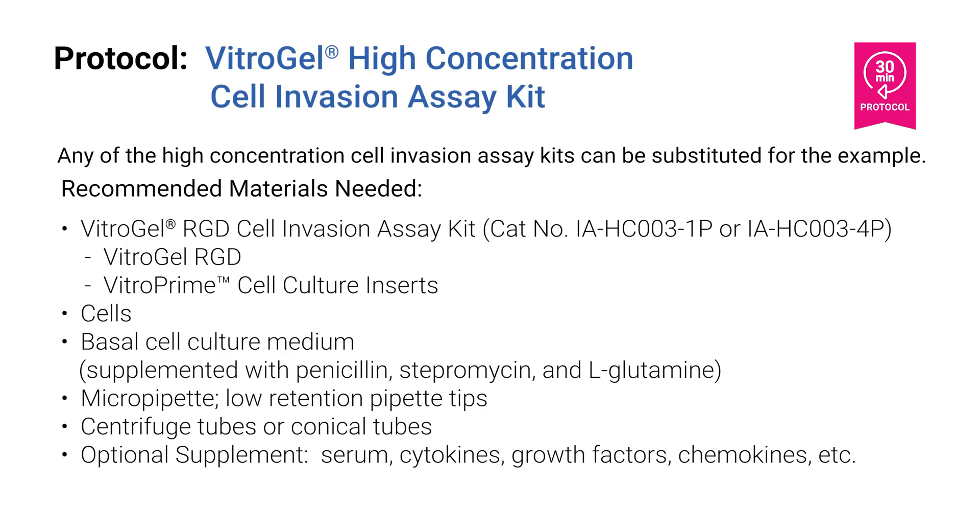The following protocol is using the Vitrogel RGD Cell Invasion Assay Kit. Any of the high concentration cell invasion assay kits can be substituted for this example. All protocol steps are at room temperature and can be performed in 30 minutes.